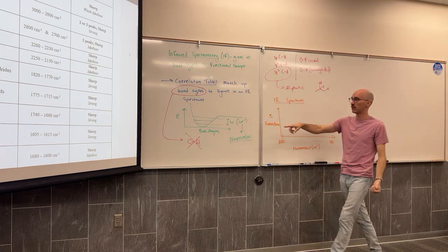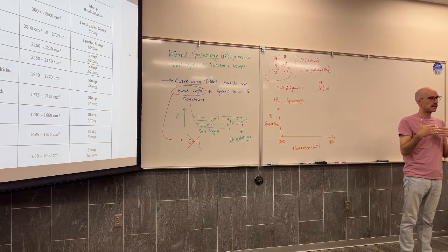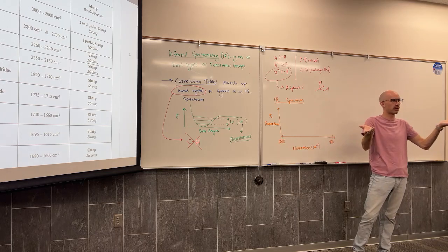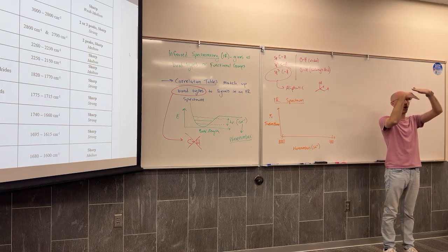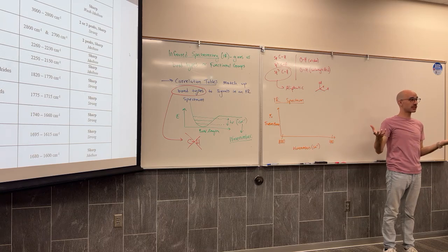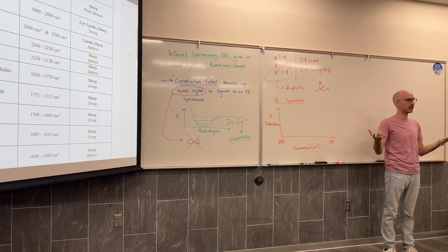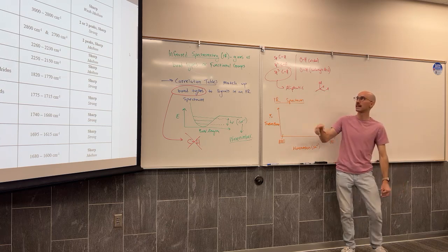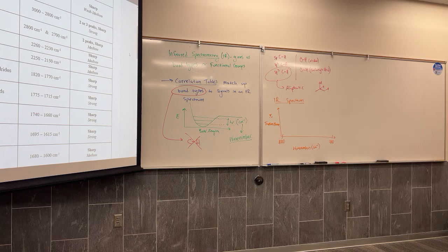Some of that sample absorbs that light within a specific frequency, whatever relates to its bond. And again, not every bond absorbs light very well. Some do absorb it very well, some absorb it a little bit. The rest of that light gets reflected off of the sample, and it goes back into the instrument and hits a detector. So the detector recognizes how much light was put out and how much light is being received. And it looks at how much light is being transmitted, the opposite of what is being absorbed. So we're going to be looking at absorption peaks.